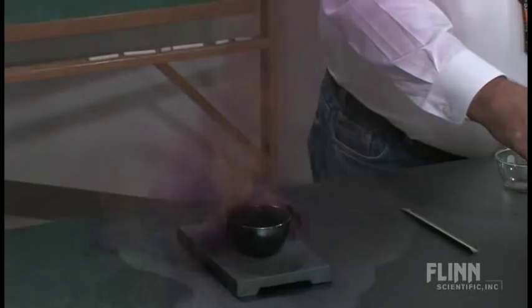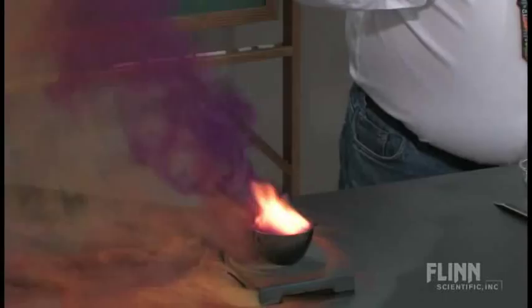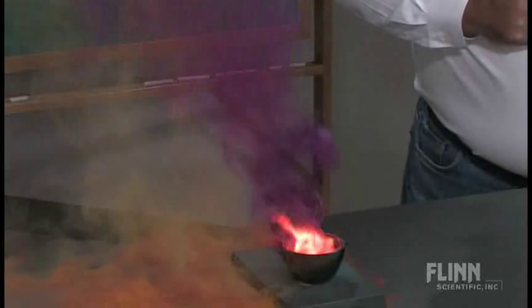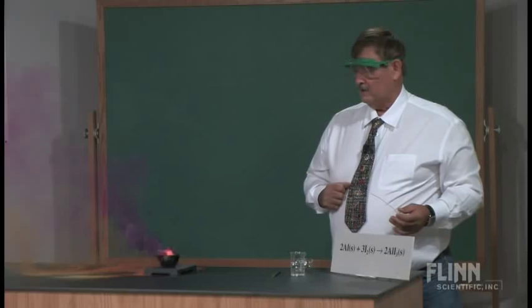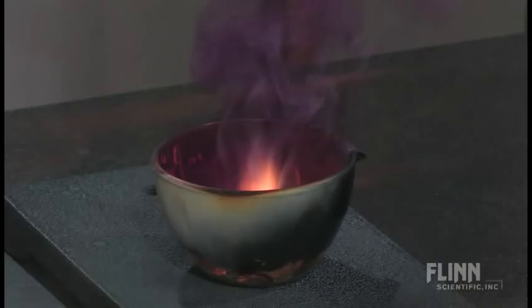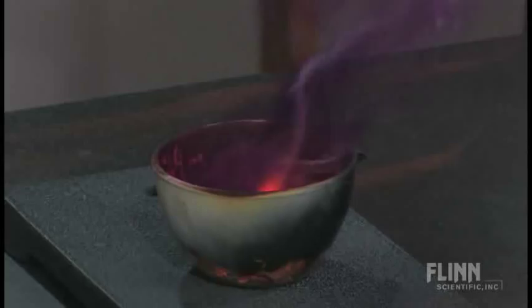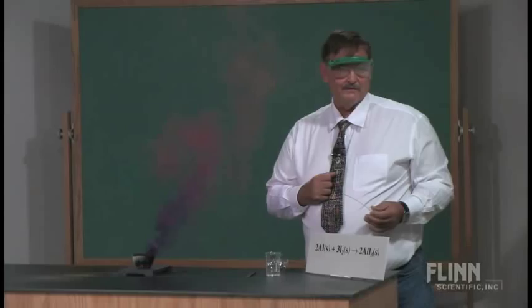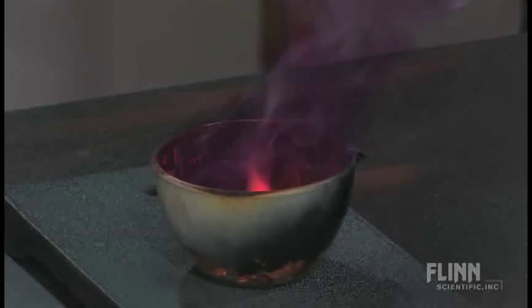What was said earlier about colored gases are poisonous. So again, remind the kids about that. I mean, look at that. Isn't that beautiful? That'll go for several minutes so the kids have plenty of time to write questions, make predictions, do all that kind of stuff in terms of using the chemistry.